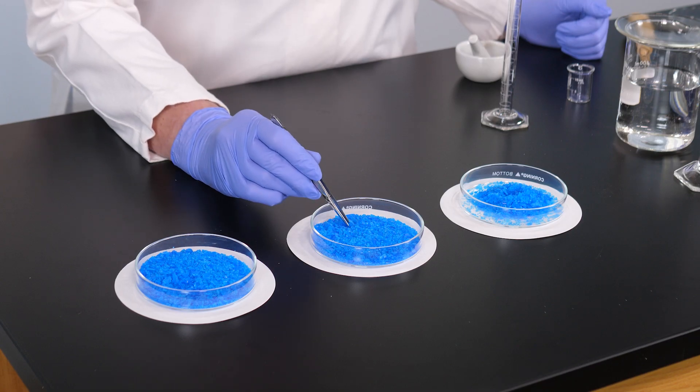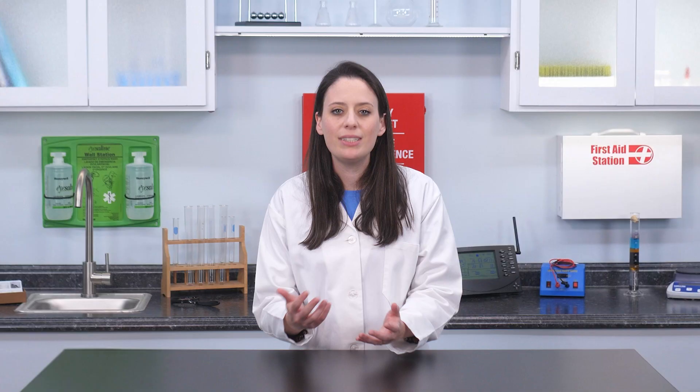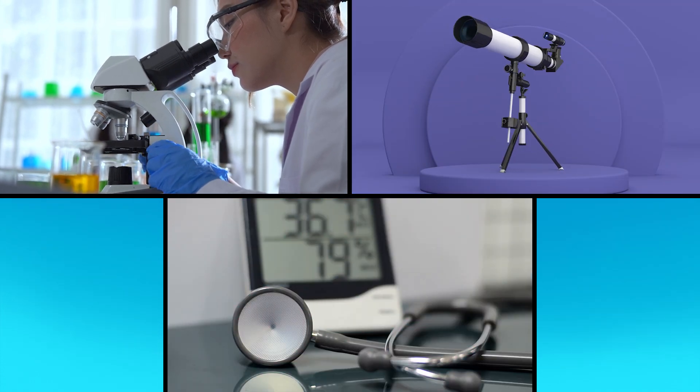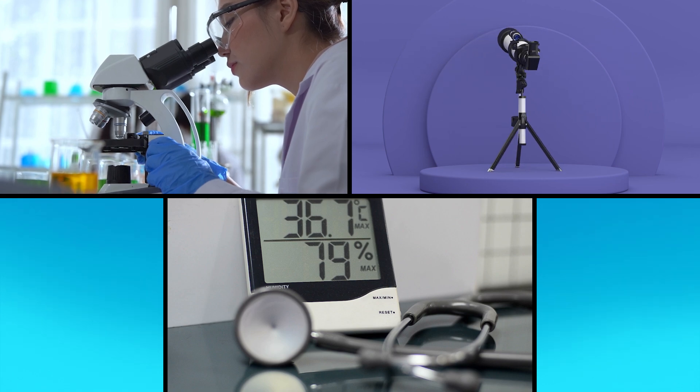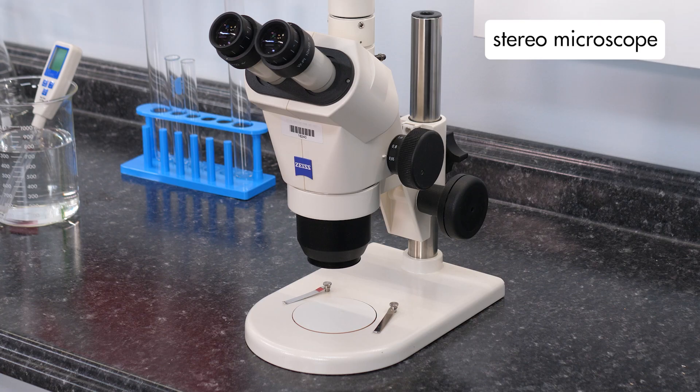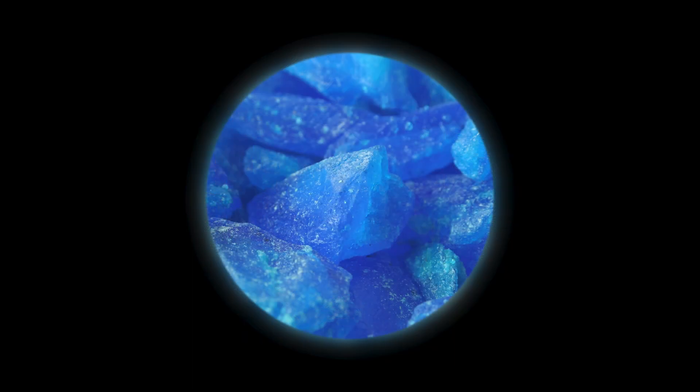Observation involves things we personally observe. Scientists often use tools, such as microscopes, telescopes, stethoscopes, and thermometers, to make observations. Let's use our stereomicroscope to examine the crystals more closely. Upon close inspection, we observe that this substance consists of hard, blue crystals.